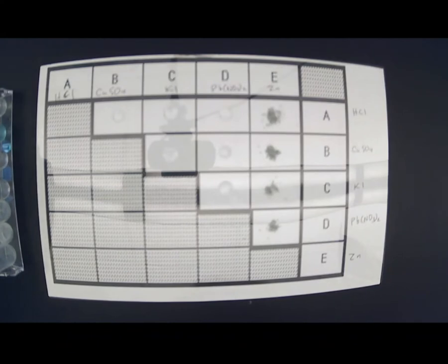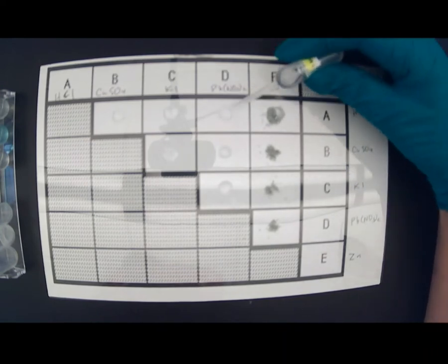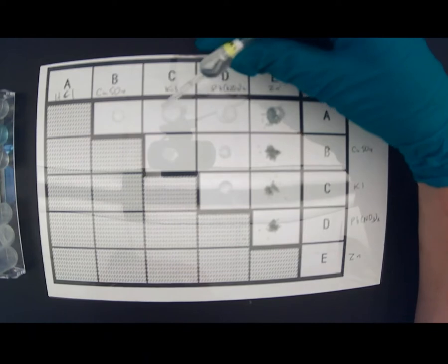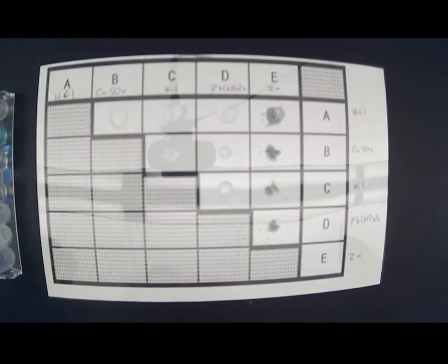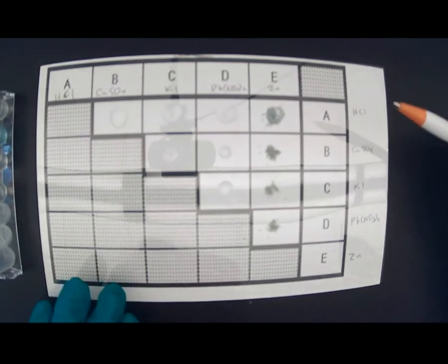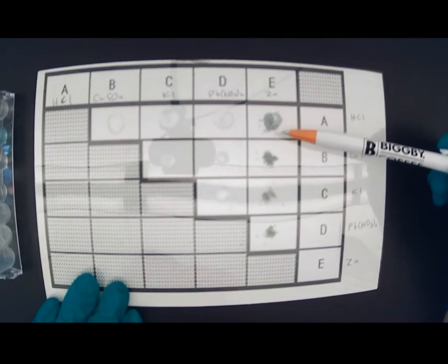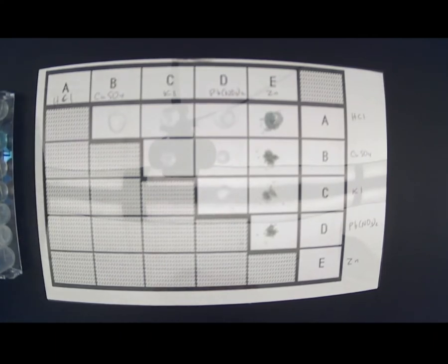Now I'm going to do the reagents going across. Let's do hydrochloric acid first — I'm going to put it on the zinc, put it into the lead nitrate, into the potassium iodide, and into the copper sulfate. It doesn't look like much is happening, but if you actually look very carefully you should see bubbles forming. I'll take a closer picture so you can see it a little better, because with this camera you can't really see very well.